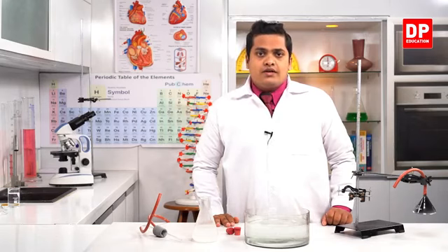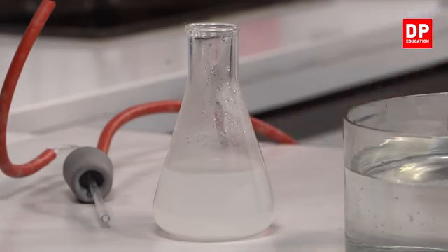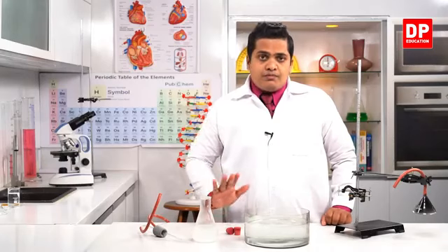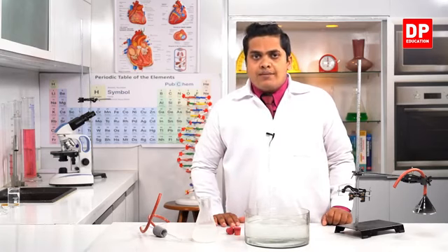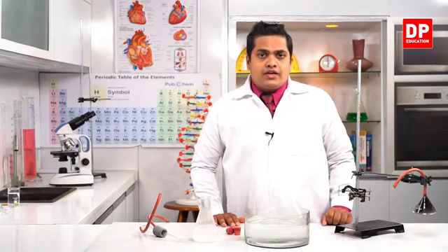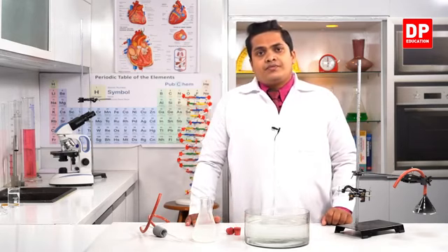So by using this observation, where the color of lime water changes, this observation can be used to identify the presence of carbon dioxide gas during the burning of candle wax.